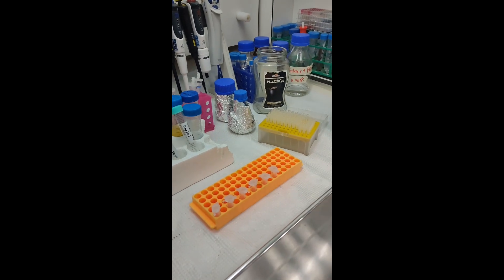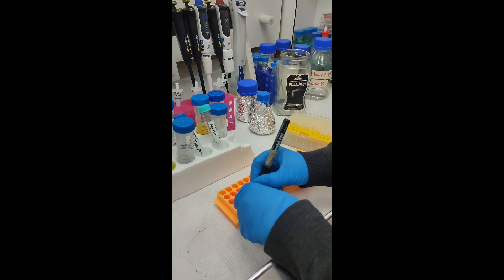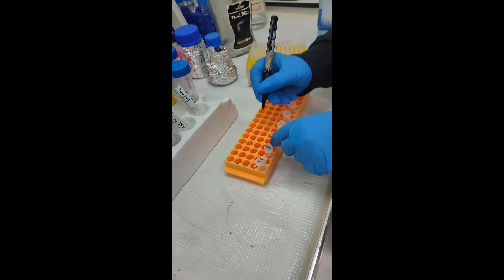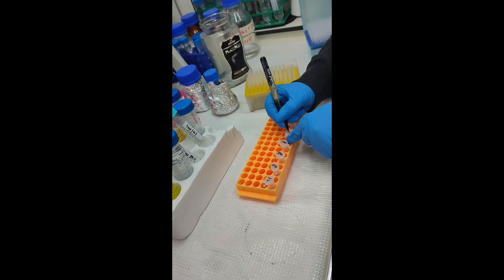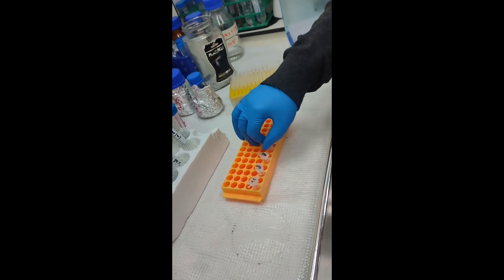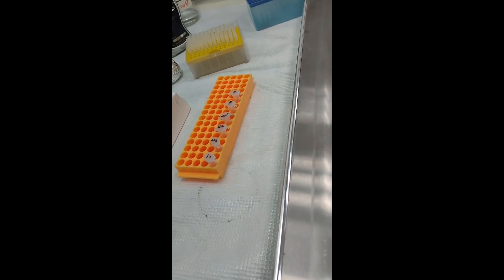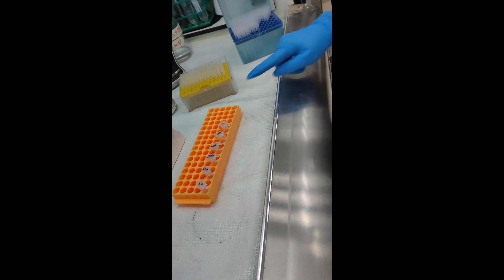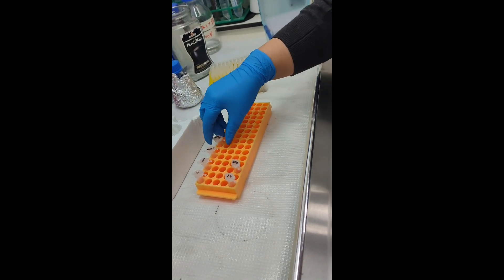This is our calibration curve. Isabella is writing the concentrations. I'm going to reorder the concentrations so we can use only one tip for the whole concentration range — zero will be first, then 0.006, and so on.